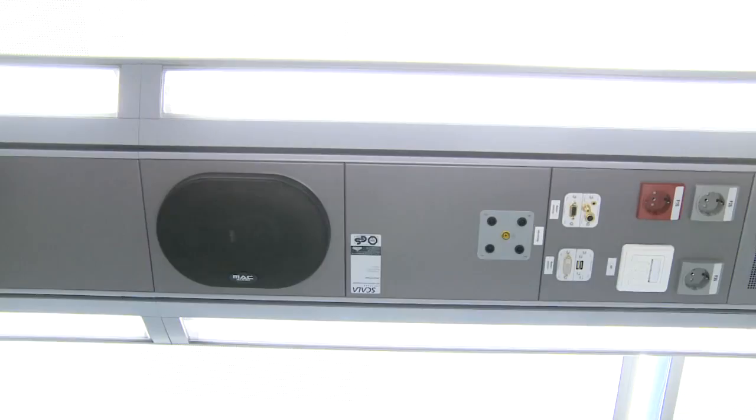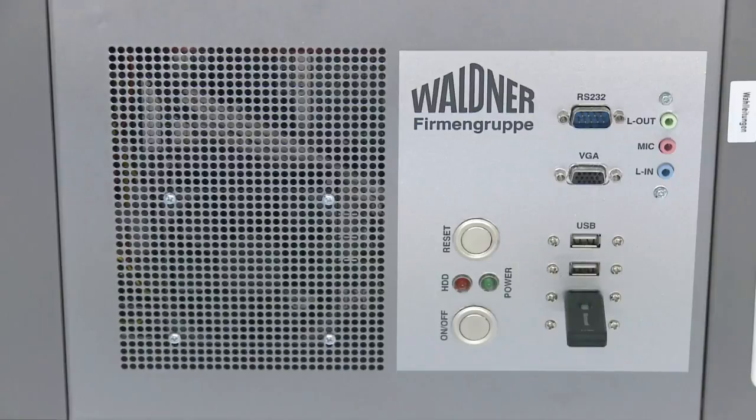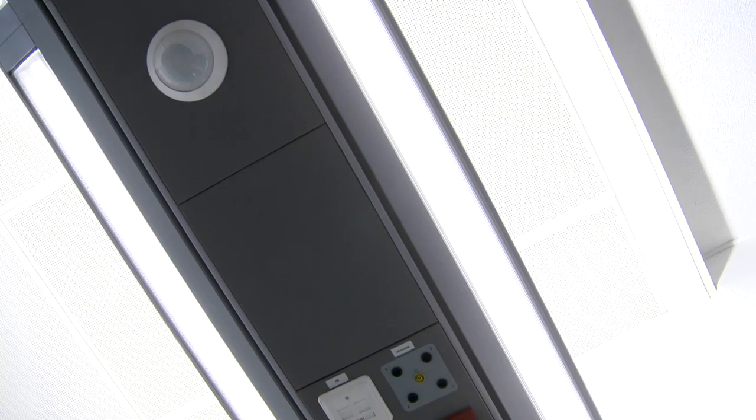Ecological, energy efficient, accessible. Scala, the intelligent modular system for your school, is made from high-quality materials.